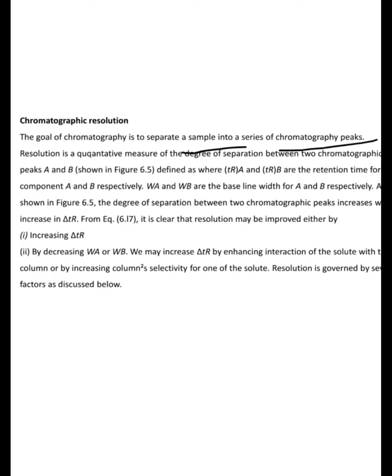And the second is that by decreasing the baseline width, we may increase the resolution, meaning the separation improves by decreasing the bandwidth, the baseline width of the given chromatogram.